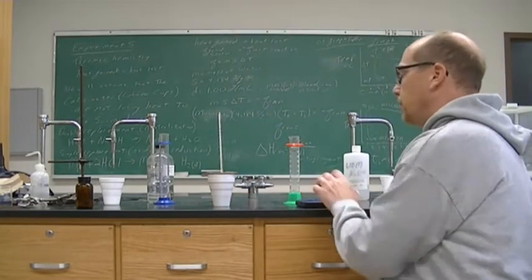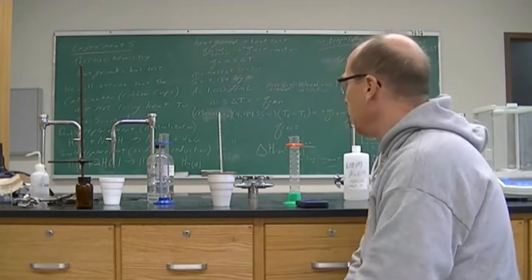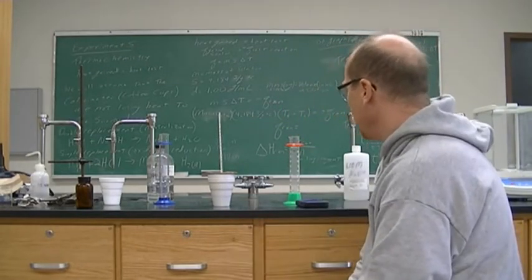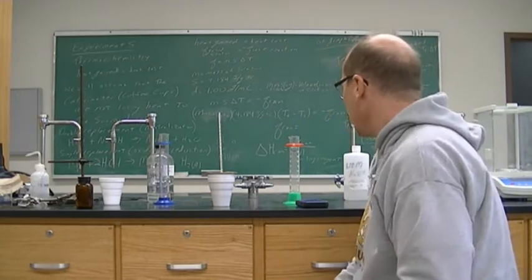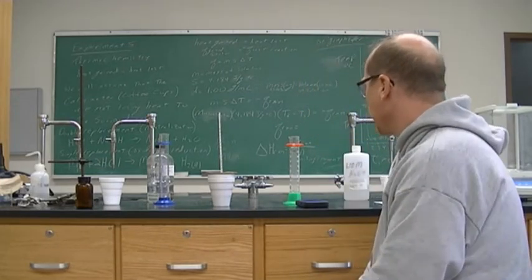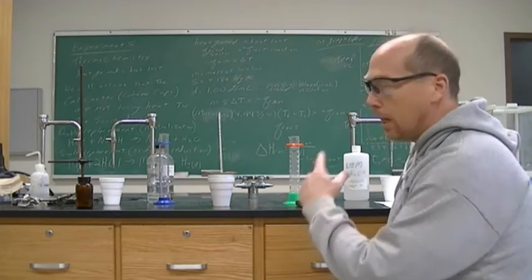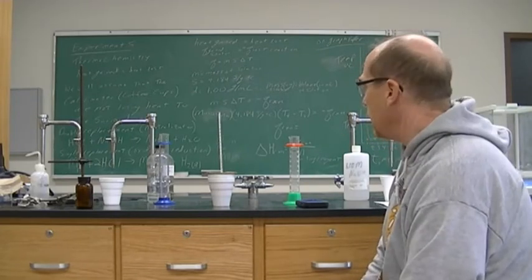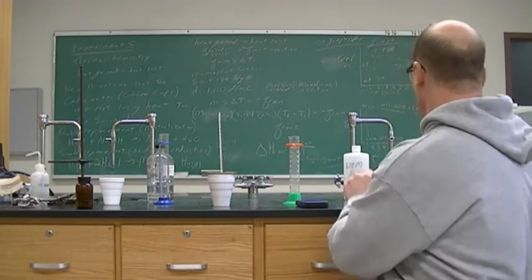We're going to run this until the temperature starts leveling off and going down a little bit, or at least just make sure it's leveling off. Then you will have to graph this data, and I will show on the board the correct way to graph for this experiment.